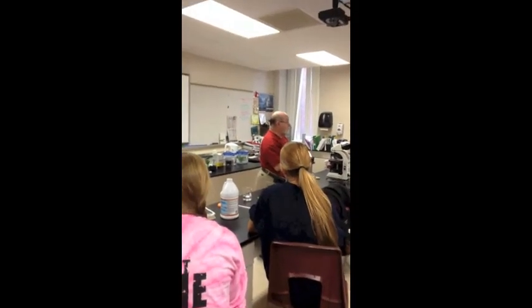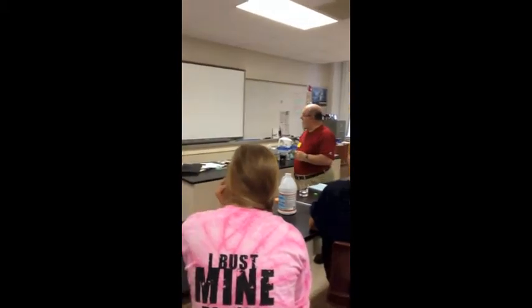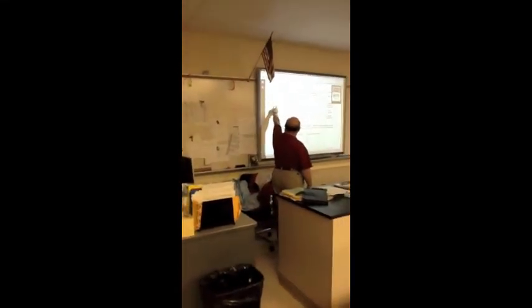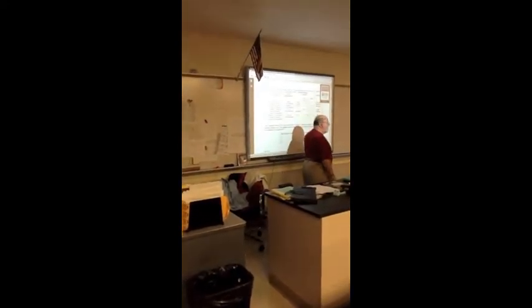to see those details in order to identify them. Now, much more difficult and it will require much more learning to do that. But to the genus. And then you see there is a number. Okay, what they did with the numbers is that they said, we're going to call number ones those diatoms that live in oligotrophic environment.